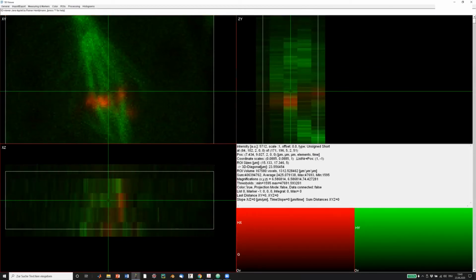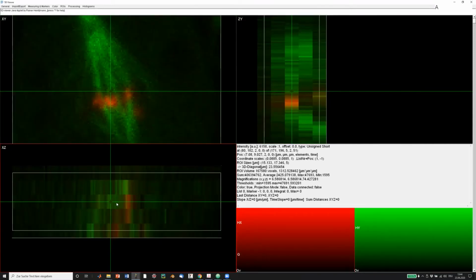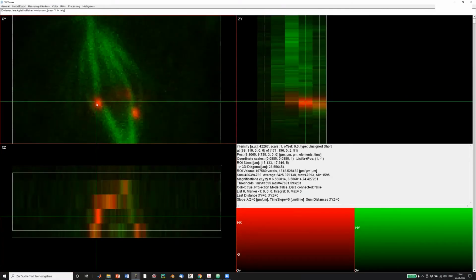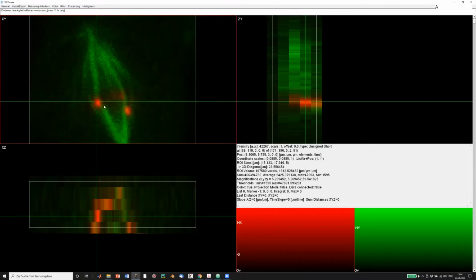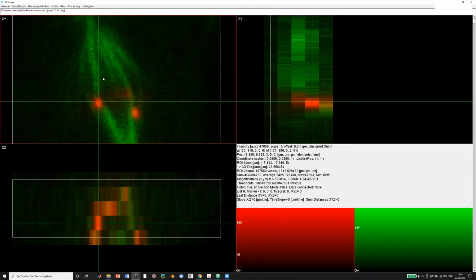So I was trying to explain that the pixel sizes are much larger in Z, and therefore this view has these very elongated pixels in Z. Sometimes you might not want that. You might want to change this aspect. When we were loading the data, we set preserve aspect, which means that whenever we zoom in, it's all locked, and there's also a hotkey called zoom orthogonal. That's the bigger than or smaller than sign. If you try to press that now, nothing will happen because the viewer is locked in aspect. You cannot change the aspect.